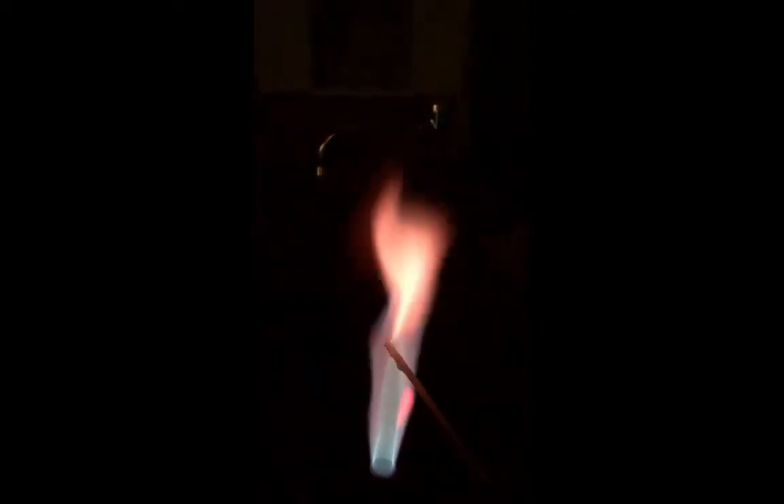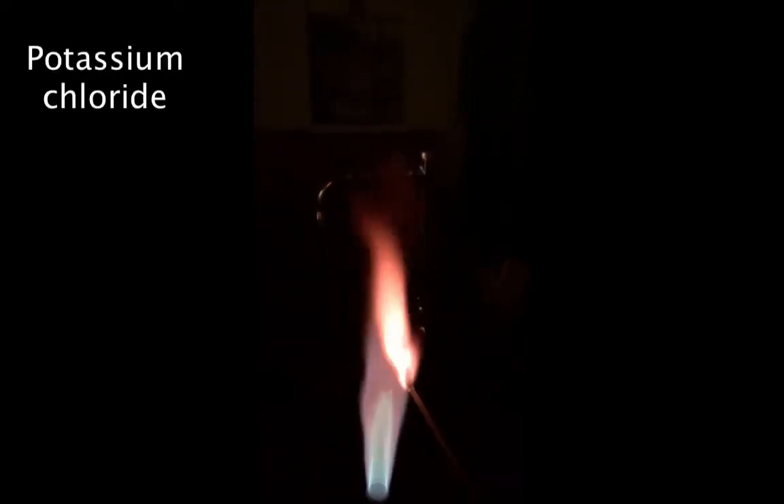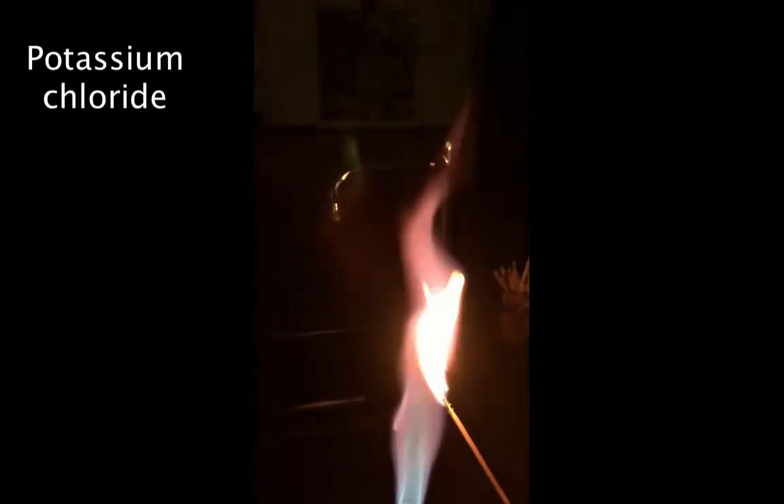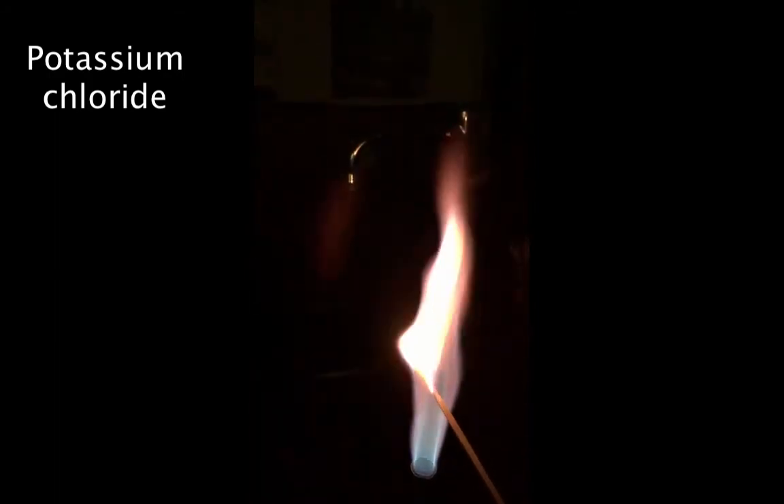Now I'm going to dip the wooden splint into potassium chloride, so the metal I'm burning is potassium. This one's harder to see in the video, but it actually burns almost a lavender — a lilac or lavender color. It's very similar to the color of the flame, so it can be hard to tell, but it does burn a nice lavender color.